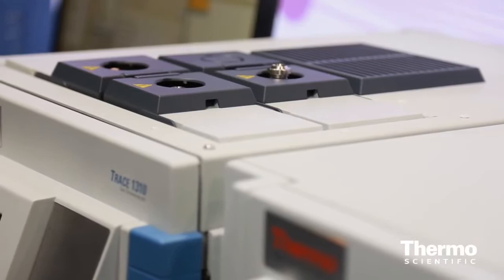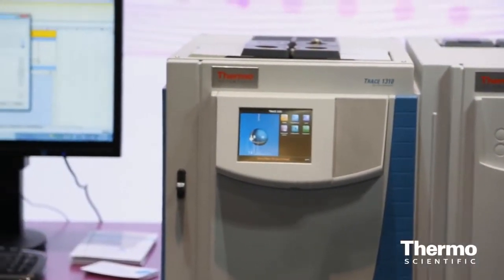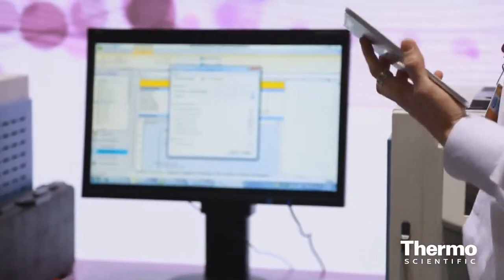The Trace 1300 auxiliary oven is really a great product. It provides a lot of technological capabilities needed to address most methods, like ASTM methods or EN methods. You can mount up to 8 valves, you can run that oven up to 300 degrees Celsius. You have a number of ways of connecting your sample to the GC itself, and everything is controlled by our Chromeleon data system, so the user can enjoy the complexity of those analytical runs without having problems in setting those up.